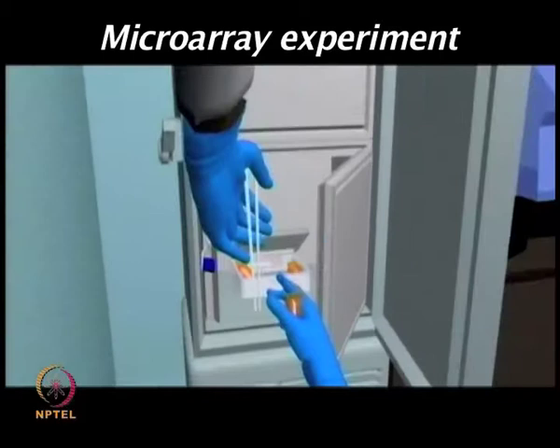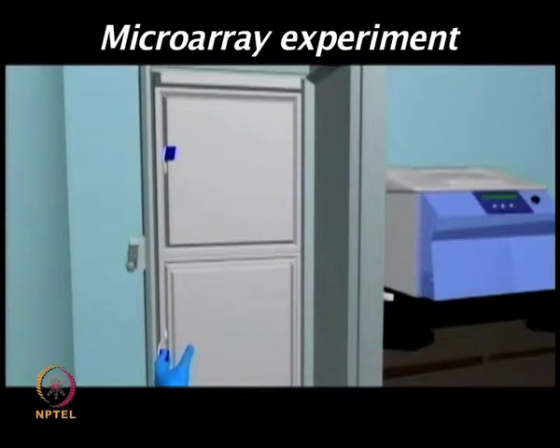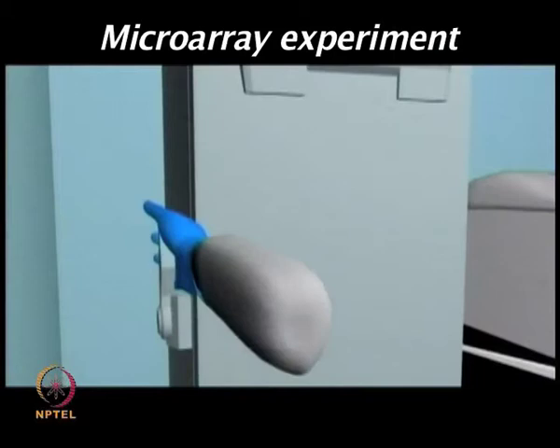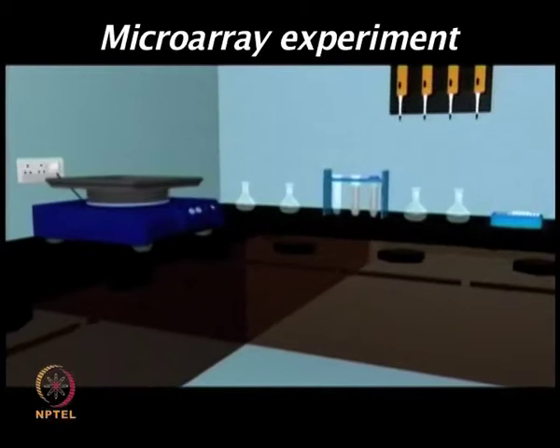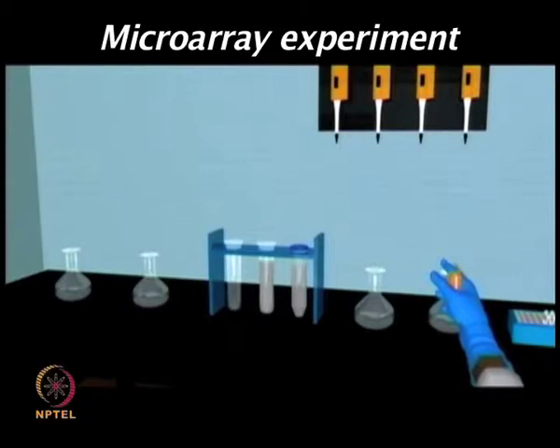In the cell based protein microarray system, the purified proteins are printed on the chip and those are stored at minus 80 degrees. As you can see in the 3D animation, very carefully the slides were removed from the minus 80 freezer. And now one needs to thaw those slides very gently to avoid any diffusion type of effect. The typical laboratory setup does not require anything very fancy, because similar to the Western blot, all these steps can be performed.